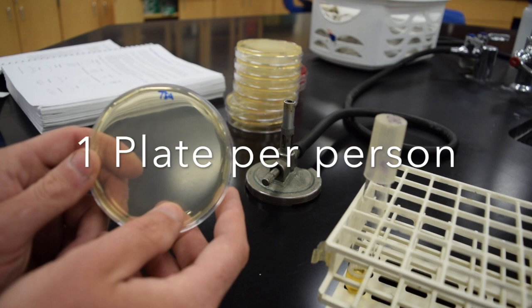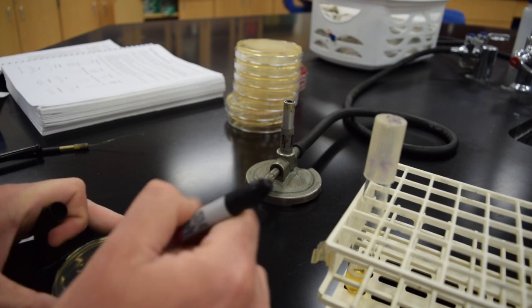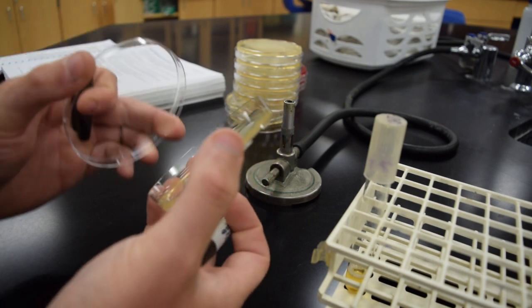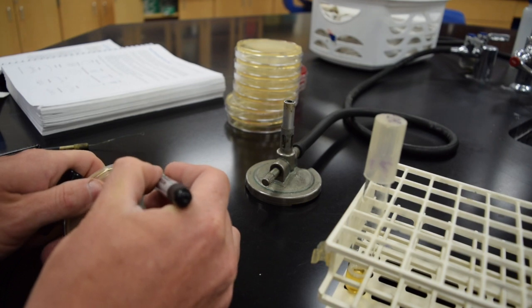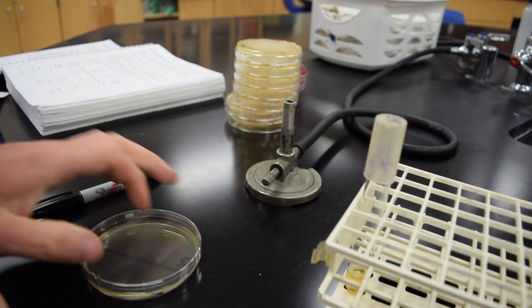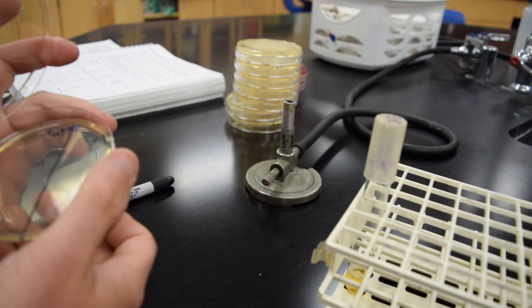The first thing you'll do is draw a line down the middle on the agar side — the agar side has the actual agar in it and the lid covers that agar. Label half of that plate 'pre-wash' and half 'post-wash.' If I flip the plate over, my pre-wash is actually on the right-hand side.